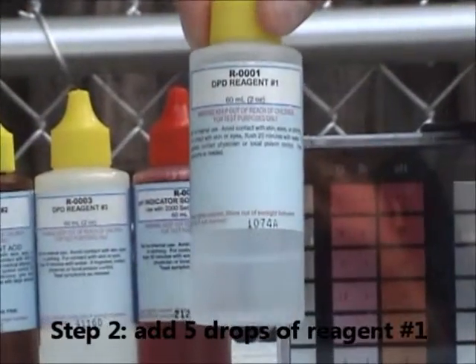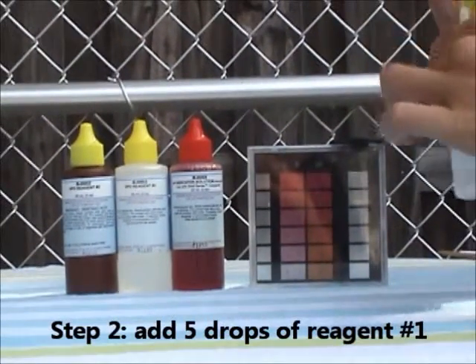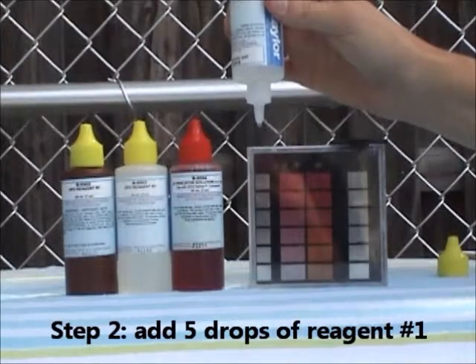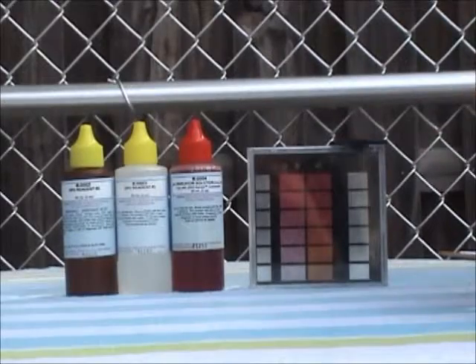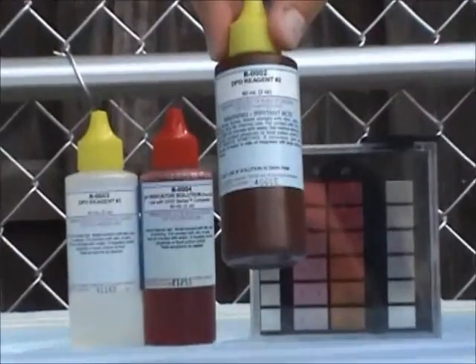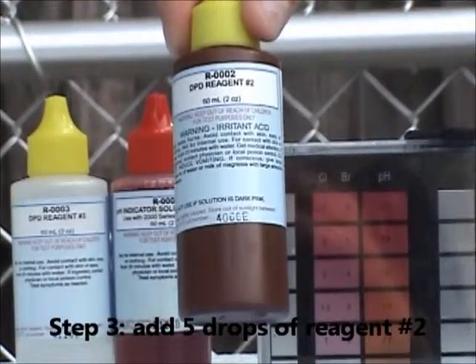Step number two in chemical testing is adding five drops of reagent one to the small side of the comparator block. Next, the lifeguard will add five drops of reagent number two, again to the small side of the comparator block.